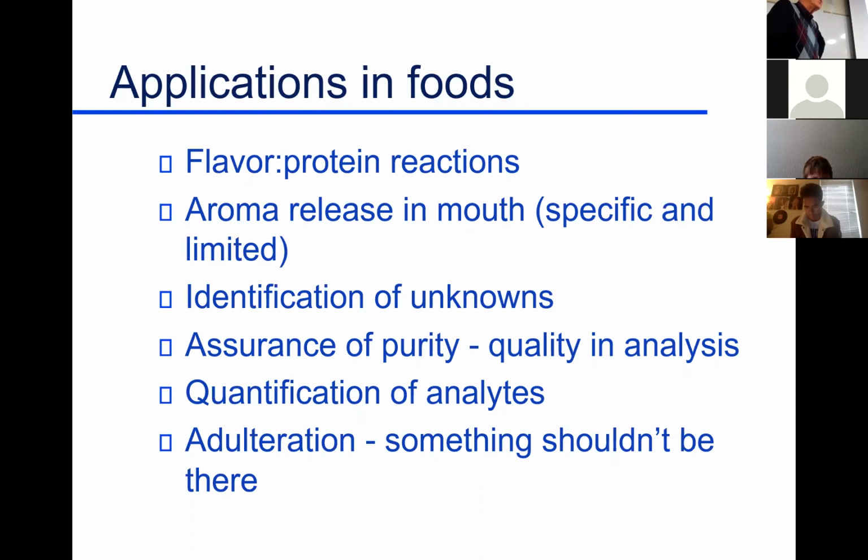These are some applications. I gave you horse or cobra venom on the first day as applications of mass spectrometry. Well, okay, here's something a little bit closer to home. I'm going to give you an example of flavors reacting with proteins. I'm going to talk a little bit about aroma release in the mouth. When you put something in your mouth and you taste it and you smell it, how do you know what really came out of that food and was there for you to smell, went through your olfactory region? Did most of it go into your stomach? You swallowed it. How do you know what really came out of that food? And so this is where we get into aroma release in the mouth and mass spectrometry.